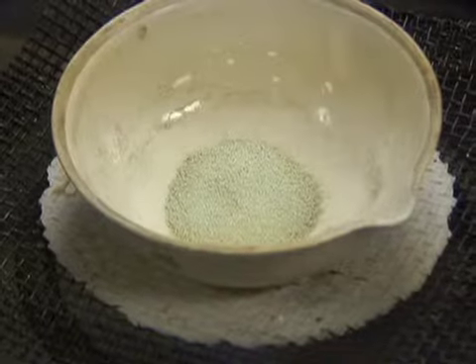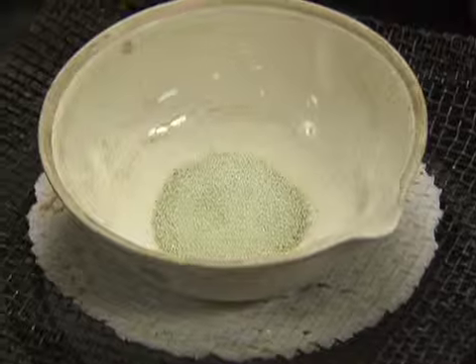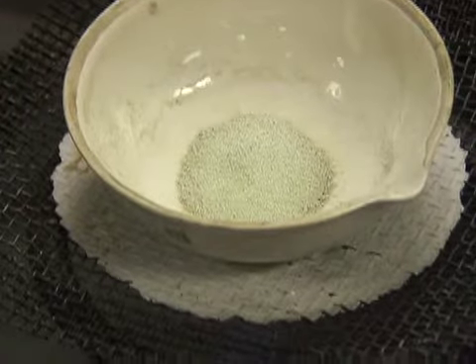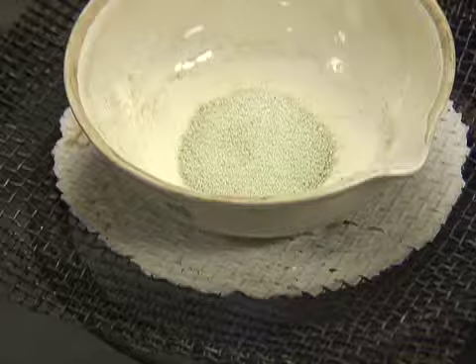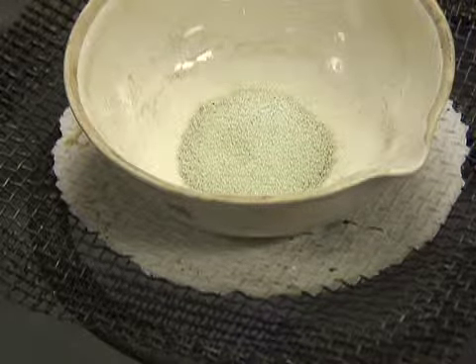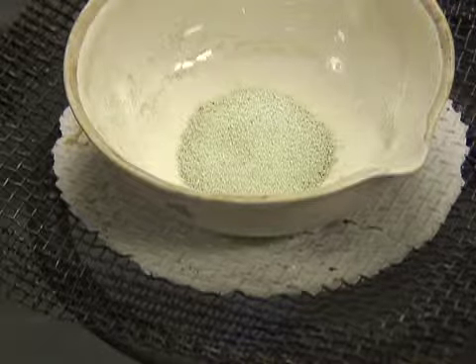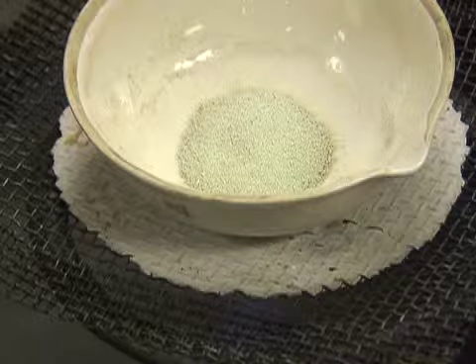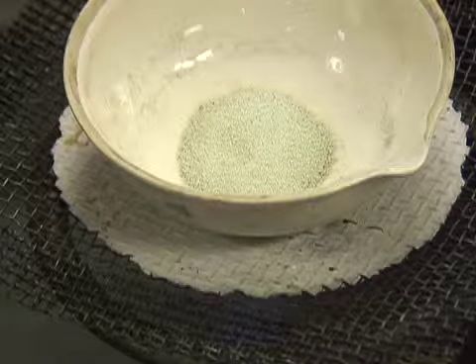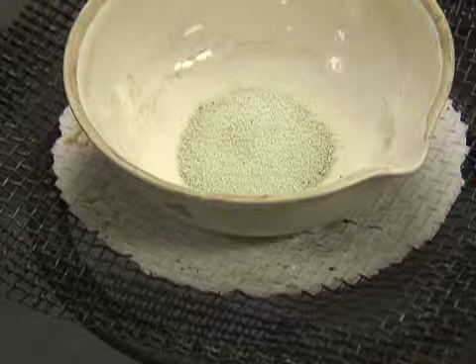I don't want to use a stirring rod to stir this, because then I get some of my anhydrous compound on the stirring rod, and that would definitely create another error in my results. Well, all the blue is gone out, and I believe that it's been approximately 10 minutes.